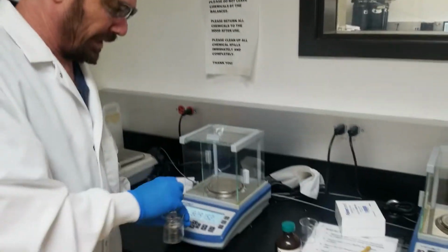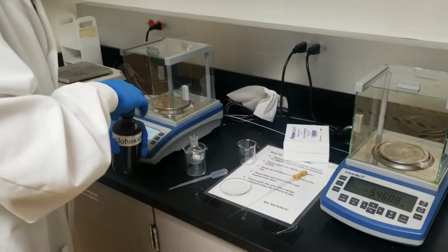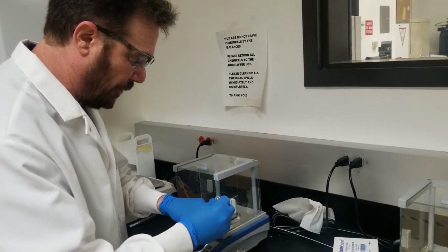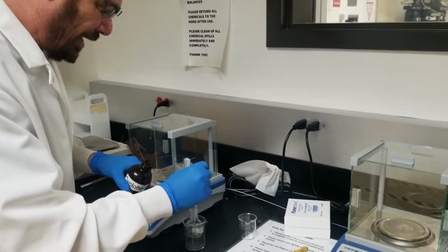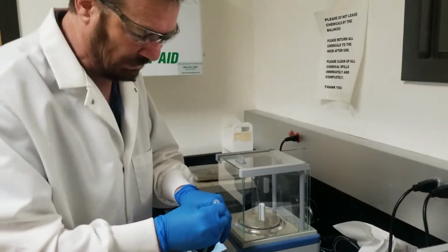And what exactly it is, we'll measure. But that'll give us an idea. And it's organic chemistry. We don't have to be super exact with this 10 to 12. And whatever we get, we'll get a yield based on whatever this number is. So, that's about 1, we'll call it.